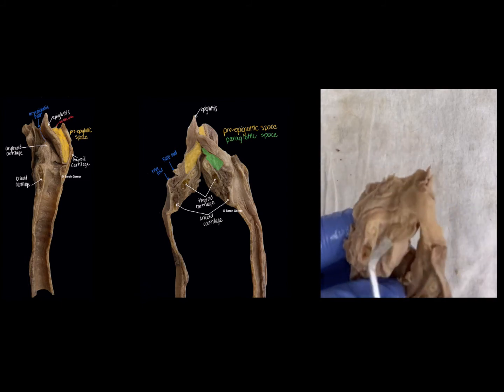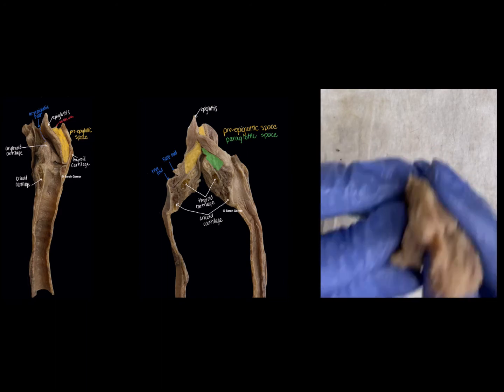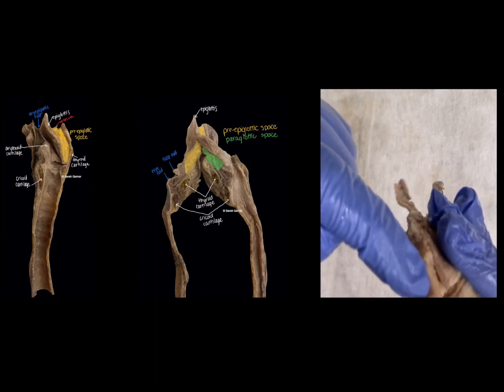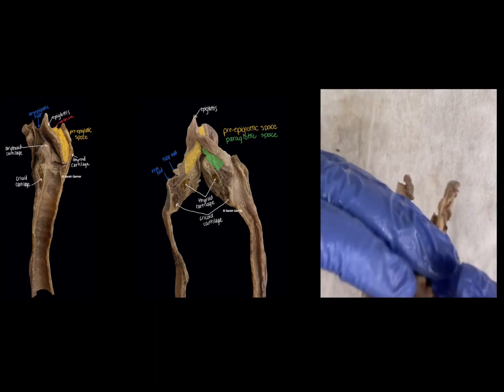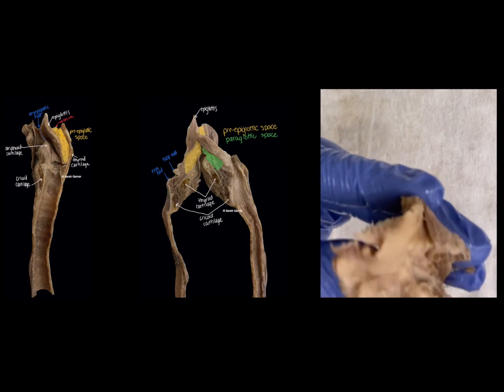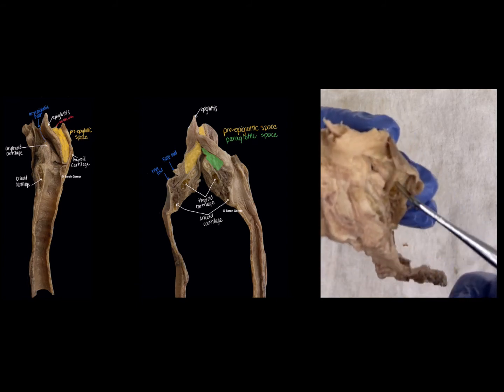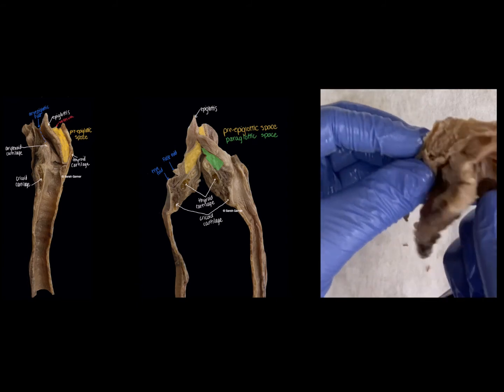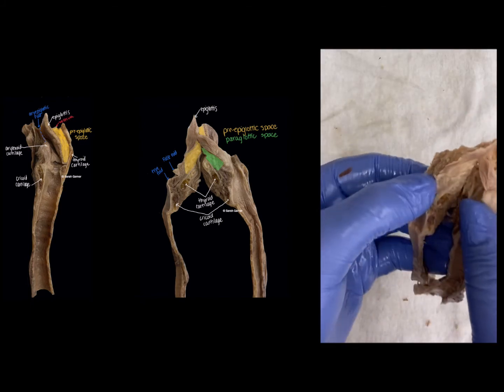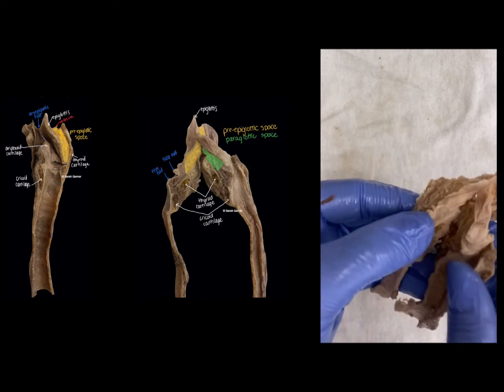So this cut is that thyroid cartilage. If we put it back together to figure out where this is anterior, this is posterior, this is that sliver of epiglottis that's left. So this would be that pre-epiglottic space, and where that cut is right here, it's on the lateral side, and if we open it up, there's that thyroid cartilage, and here's that paraglottic space. So when you're taking a section of that, you want to go through, basically like I did here, and cut here and see if that tumor is extending into that fat-filled space there.